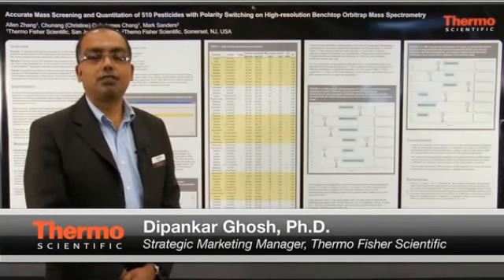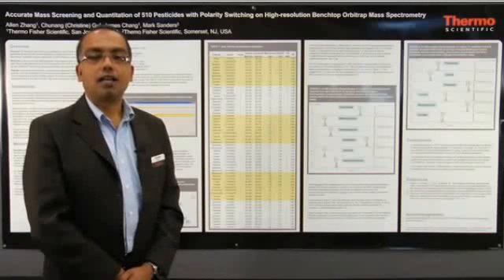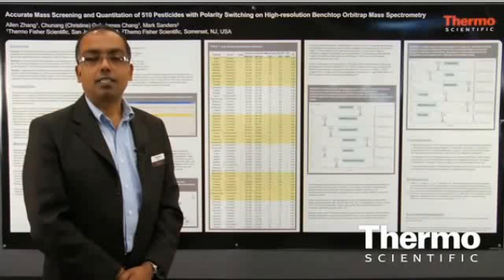I'm the strategic manager for environmental and food safety with Thermo Fisher Scientific, and I'm here at the ASMS conference in Salt Lake City, Utah, and I'd like to talk to you about an assay we've developed for the analysis of 510 pesticides using the LC-MS Exactive platform.